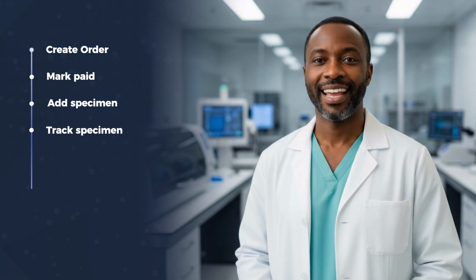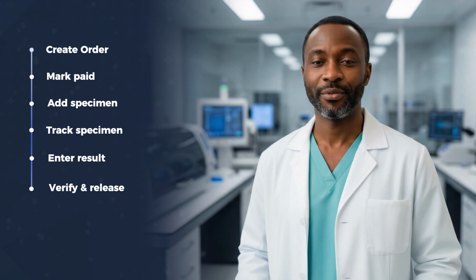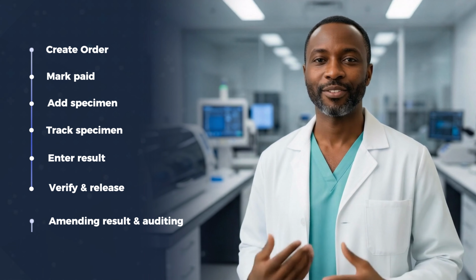In this video, we will walk through the full lab workflow in GoodMedico, from creating an order to releasing a result so the patient can see it. We'll use the real screens and buttons you see in the app. The flow is create order, mark paid, add specimen, track the specimen through collection and receipt, enter results, verify and release with digital signatures. We'll also cover amending a result and how that's audited.